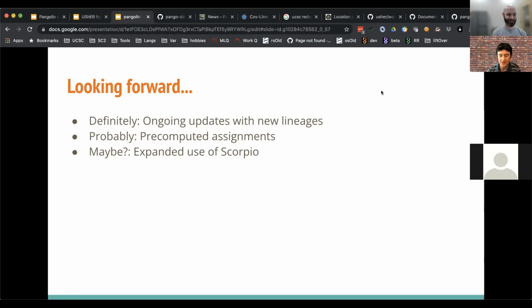That will be a way to get faster assignments for pre-existing sequences that haven't been manually designated, but the Edinburgh folks can pre-compute all the pangoLEARN stuff on existing sequences, and UCSC can pre-compute UShER assignments for existing sequences, and feed in a new hash that pangoLEARN can then use to zap directly to an assignment instead of running a model.